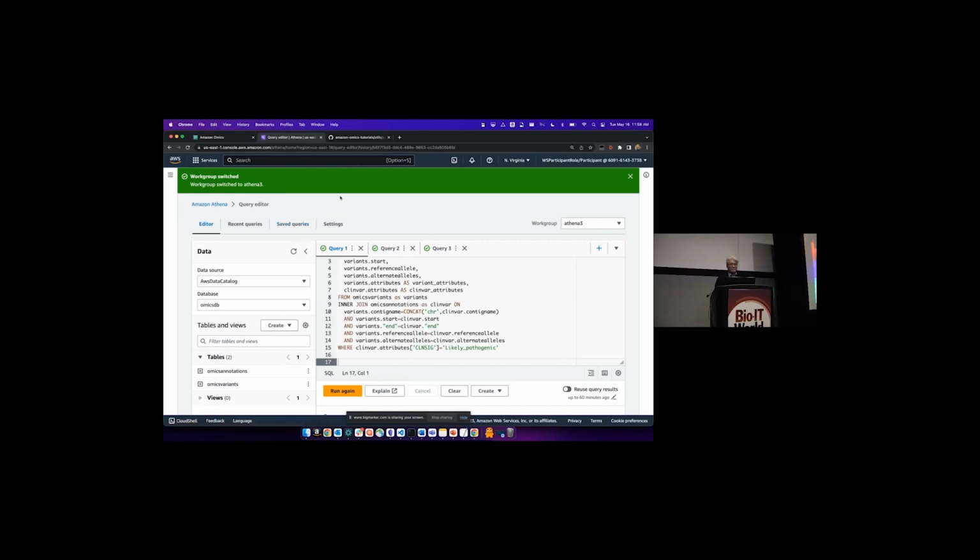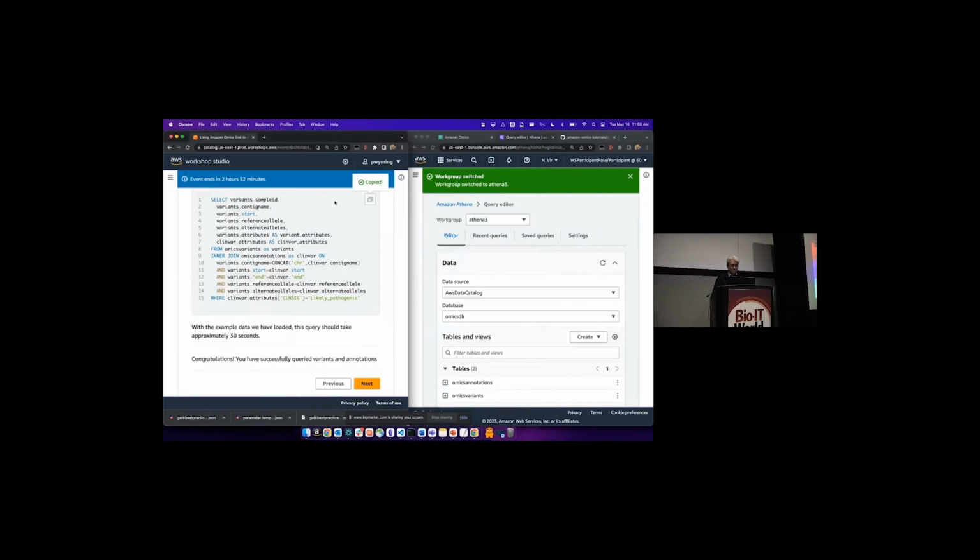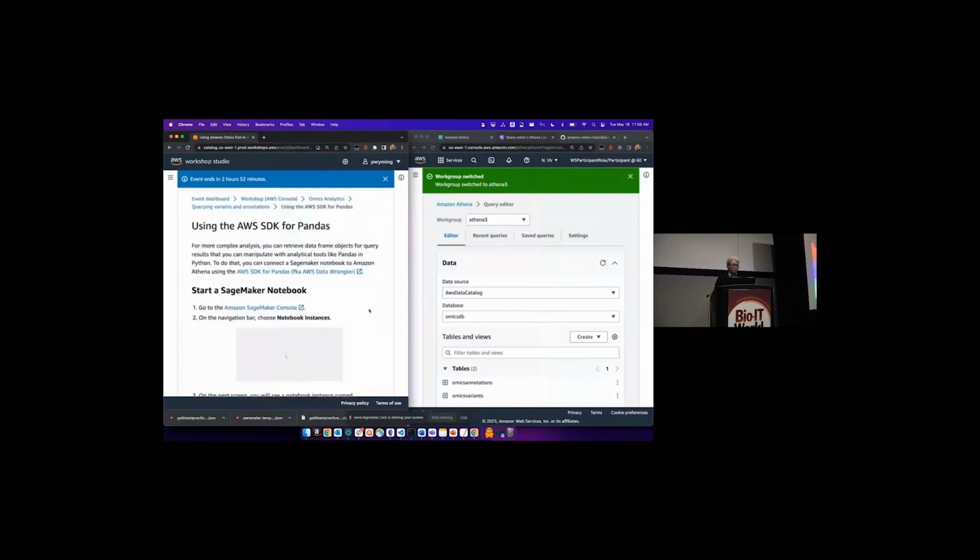If you ask a performance question, you always get an "it depends" answer. But the thing I'll get into when we get to the slides from Bill and me is that it depends specifically on how much filtering you can apply to the query. Athena is very good at processing very large data sets if you give it very specific filters. If you give it a select star, or ask for half of a 50 terabyte data set, it won't finish. It'll time out after 30 minutes.